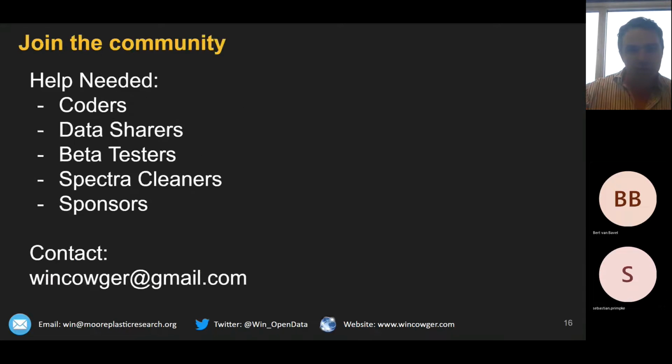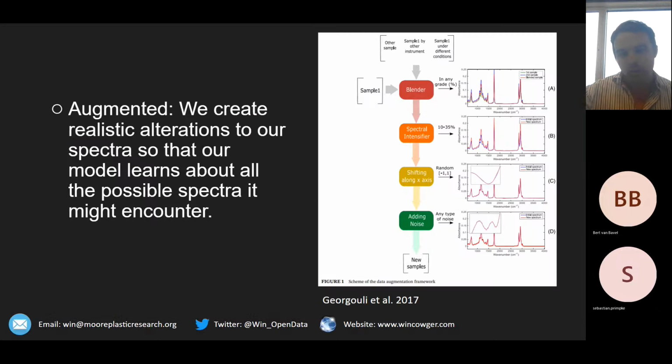One thing I think, in this paper they were doing this thing called blending, which is basically adding spectra to each other. So let's say I know what a silver filter spectrum looks like, and then I know what the polyethylene spectrum looks like, and you just add the two together, and if they're equal spectral intensities, then you would get what that spectrum looks like. And yeah, I'm interested in doing that.